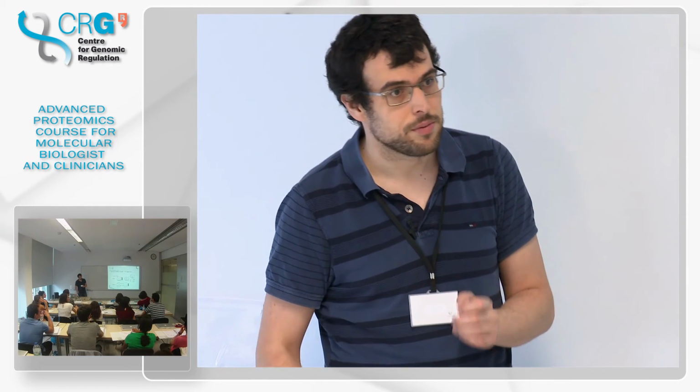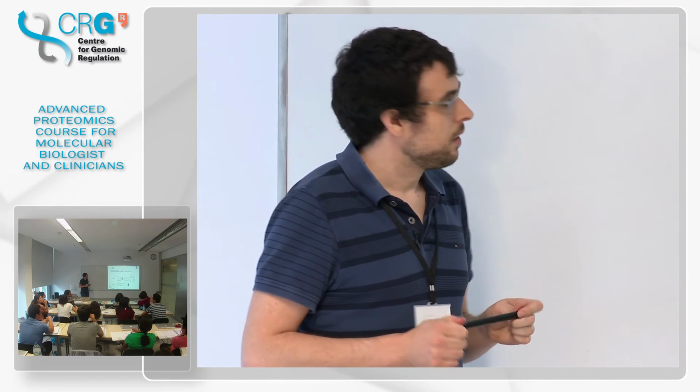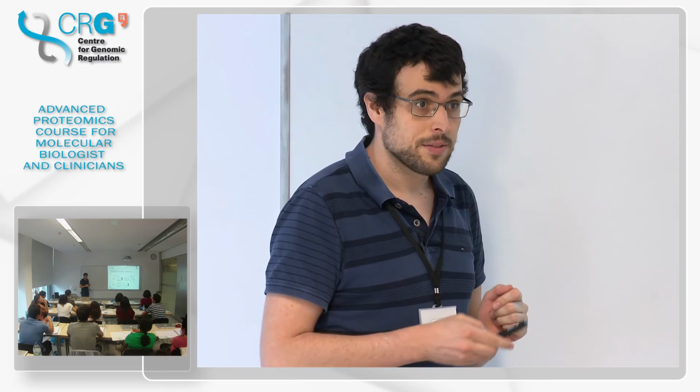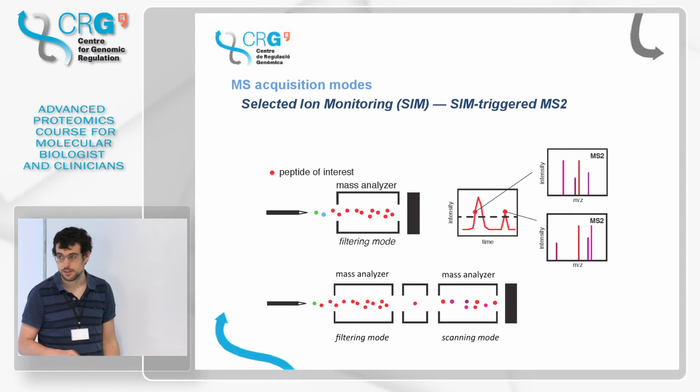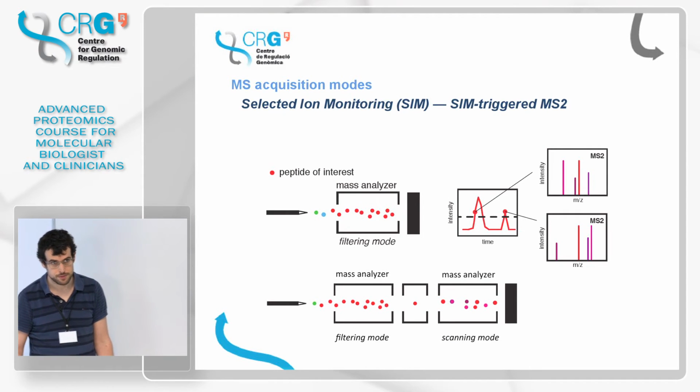But the monitoring would be to be able to quantify. Exactly, yes. The second one is to identify. So here we quantify, and here we identify in this case.